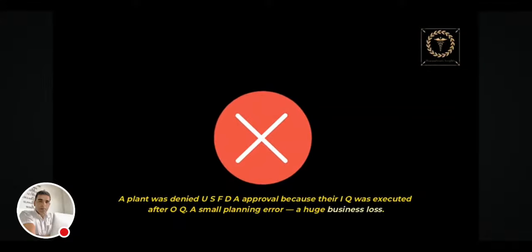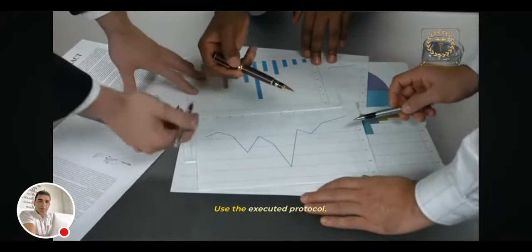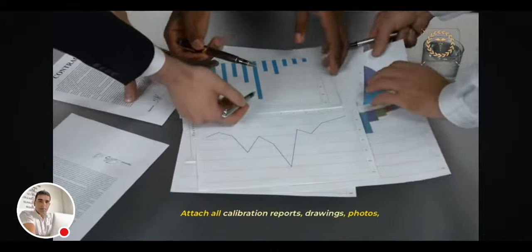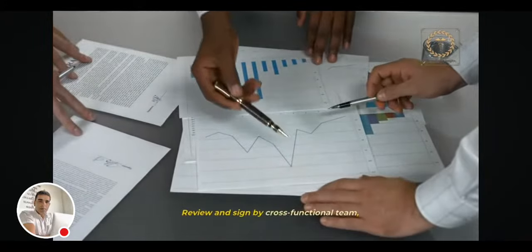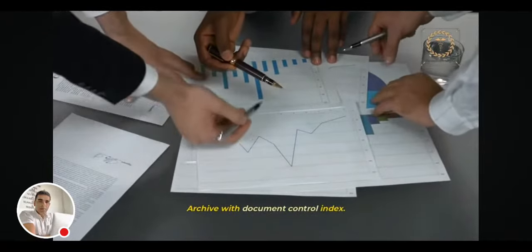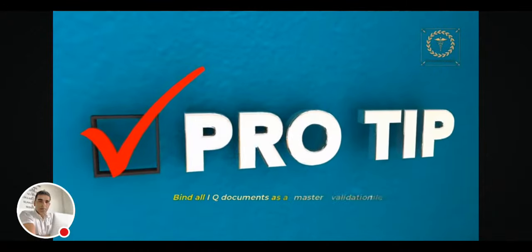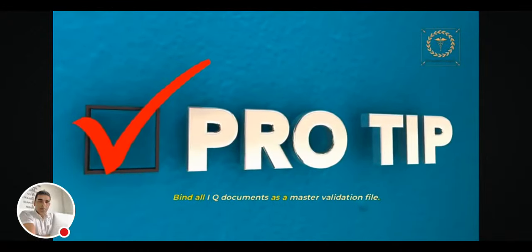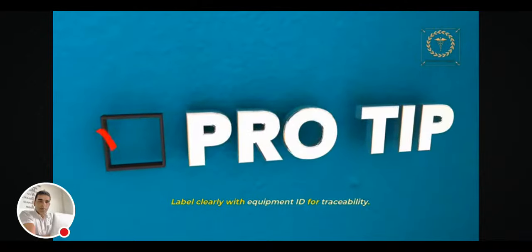business loss. For IQ report preparation, use the executed protocol, attach all calibration reports, drawings, photos, close deviations formally, review and sign by cross-functional team, archive with document control index. Let me give you a pro tip: bind all IQ documents as a master validation file. Label clearly with equipment ID for traceability.